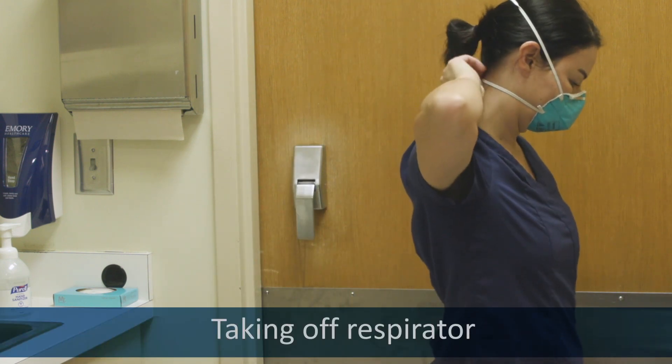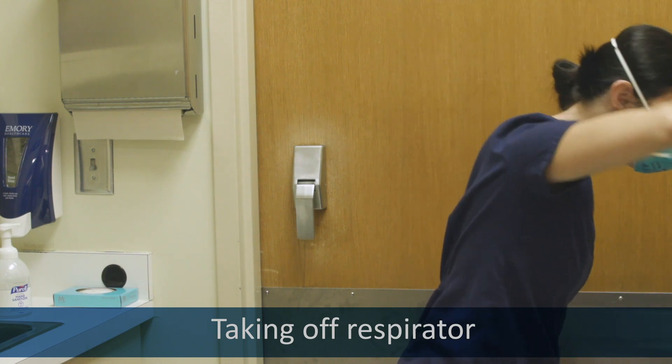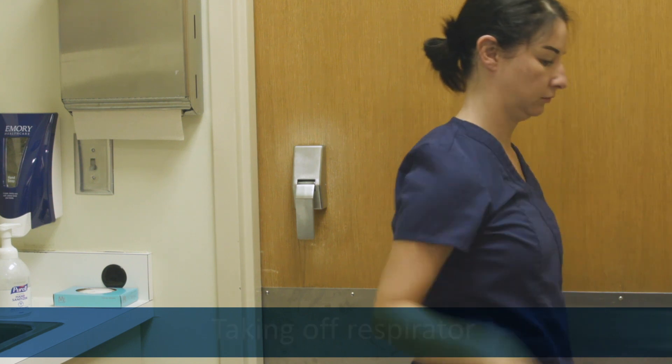Grab the lower strap of your respirator and pull it back and up over your head without touching it to your face. Do the same with the upper strap until your respirator comes off, and dispose of it.